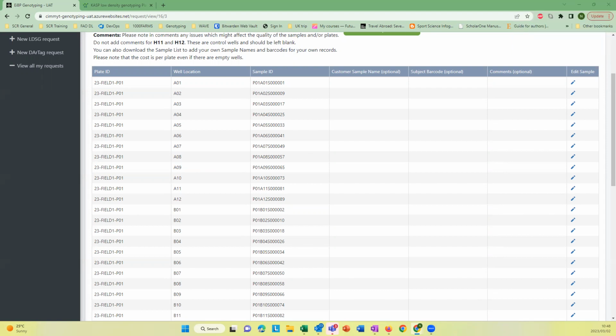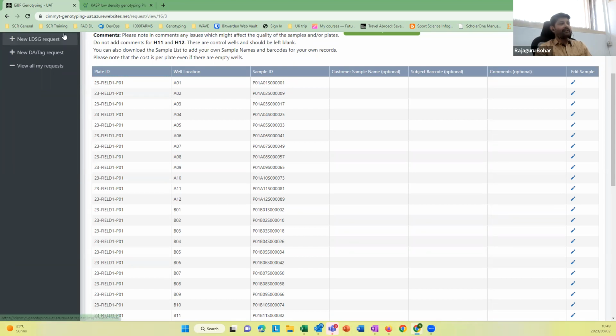Does that mean that this unique code, which is usually required by Intertech, is not required anymore? It's a combination of numbers and letters. Previously we didn't have such a system. That's the reason that, from a Galaxy instance or from other software, you generated a separate unique alphanumeric ID.